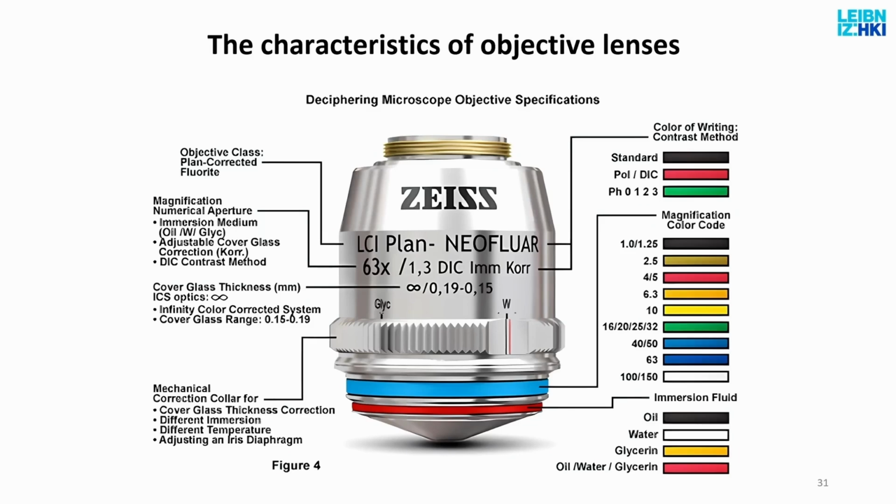And this is important. If you don't set it up, like we discussed, the lens will work, but you will have spherical aberration. Much more than this. It also means that if you're working with a petri dish, the bottom of which is plastic and thick, you will not see through. Your image will be so blurred that you will not recognize anything.